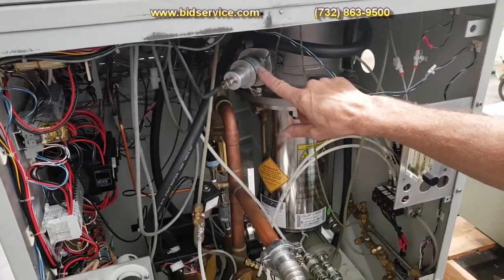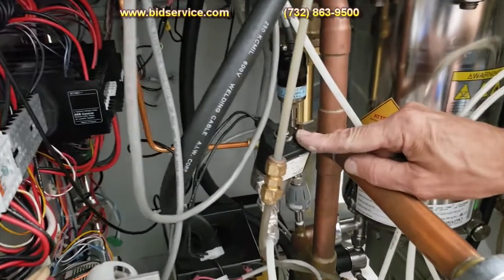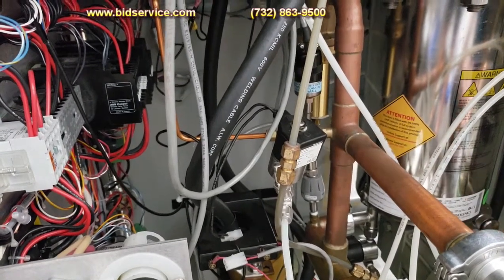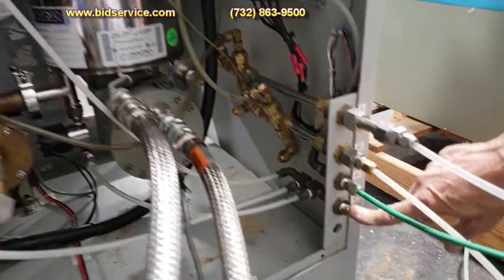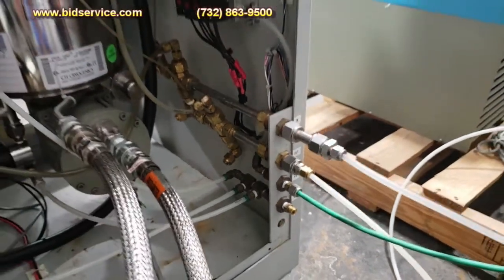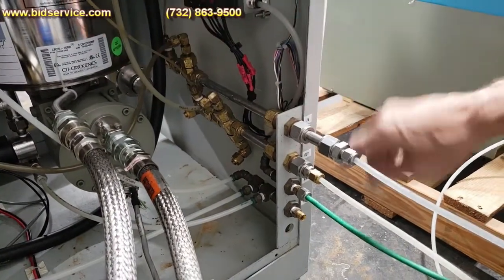The IMG-100 cold cathode gauge tube is reading your chamber vacuum. There are also a couple of TCs in here. There's a valve here that allows you to vent the fore line while you're venting the cryo during regeneration — I have it disconnected for now. You do have a nitrogen line used to vent the chamber, purge the fore line during regeneration, and purge the cryo pump. You also need compressed air at a pneumatic manifold — operates a couple of the valves.